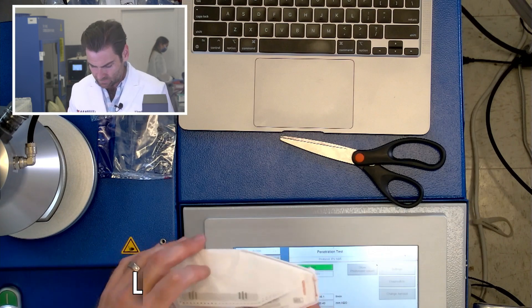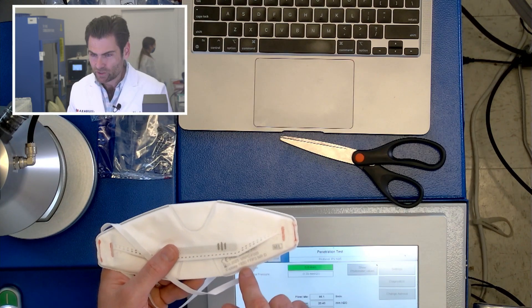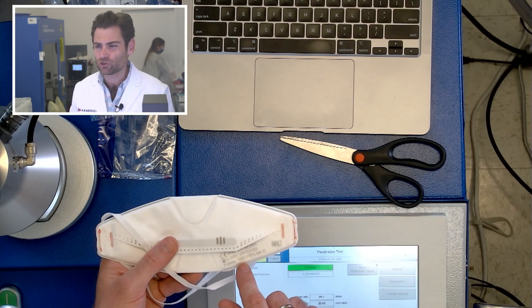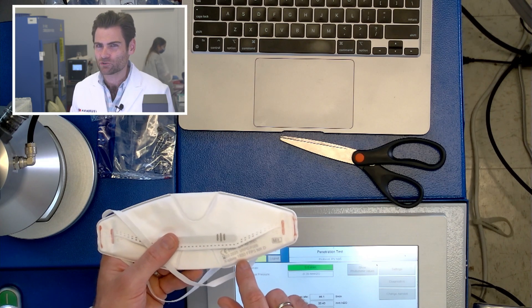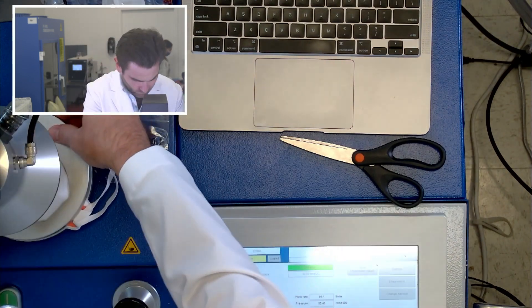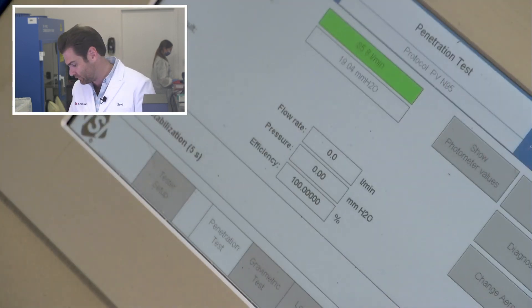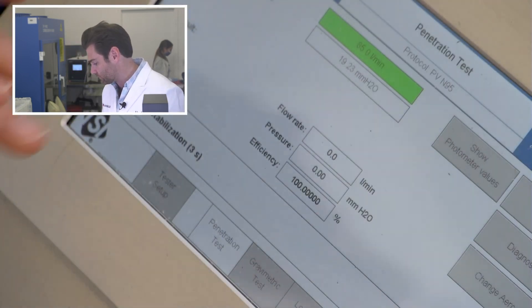On to the next one guys. Look at this — 1930. I feel like if you're a German company, you probably shouldn't be referencing those years. I don't know, I'm just saying — I can say that, I'm German. This is a PFE machine — particulate filtration efficiency machine. We're doing the Drega 1930 FFP3.